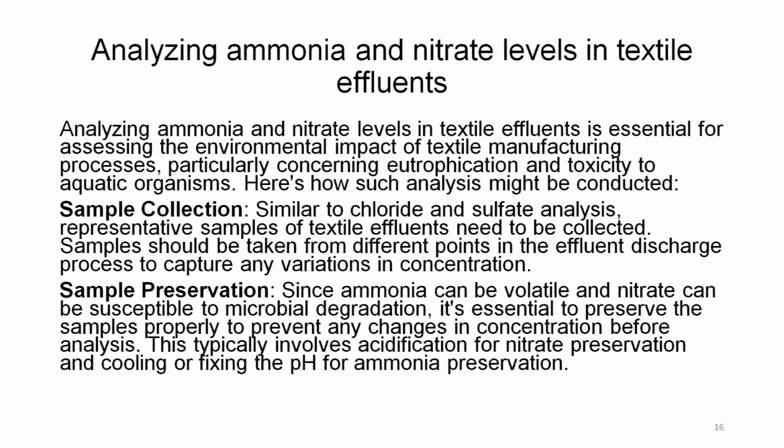So, there are ways to preserve. If it is for the analysis of nitrate, then the solution is acidified. If it is a matter of fixing the ammonia, then the pH is adjusted.